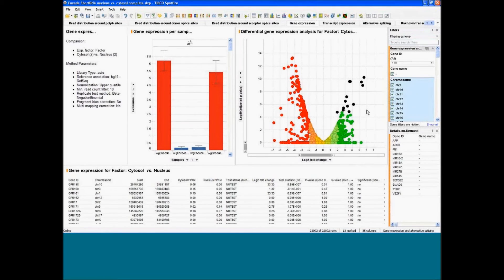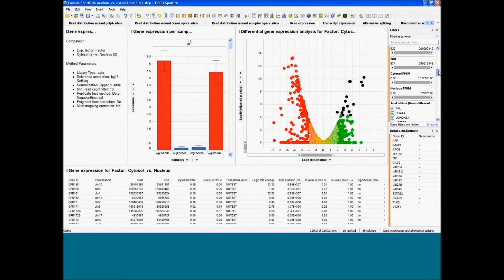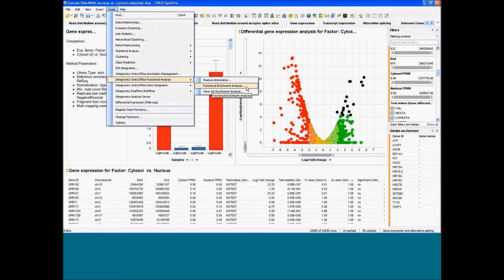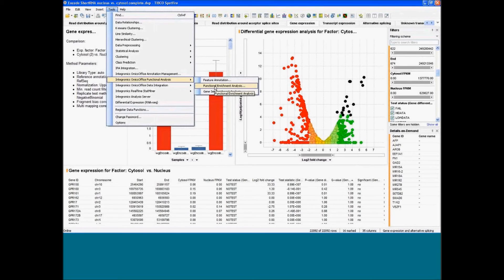Once you select a subset of genes — by marking them or using filters on fold change or p-value — you can use the functional analysis tool to run gene ontology or gene set enrichment analysis specifically on this subset. The question would be: is there a biological function overrepresented in this subset of genes? This can run straightforwardly.